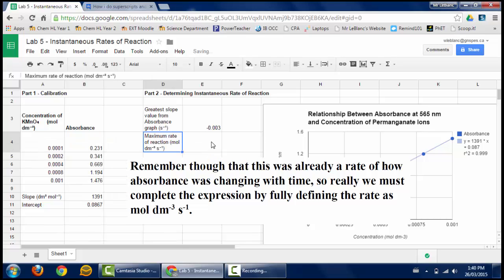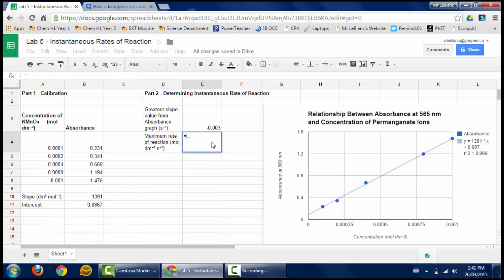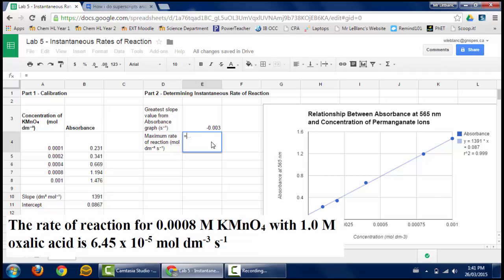You can see I'll clean up the spreadsheet. You can put on text wrapping, that sort of thing, so you can read it. You're not passing this in to me. This is just so that someday in the future, when you need to, you know how to clean up the Excel files.